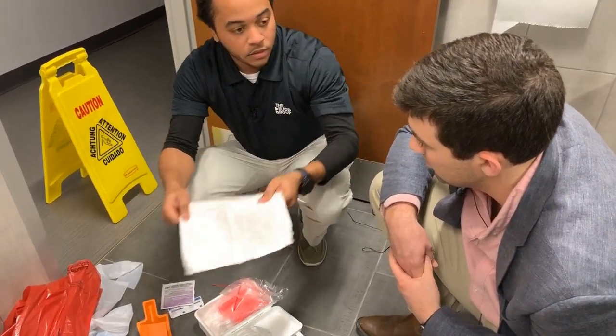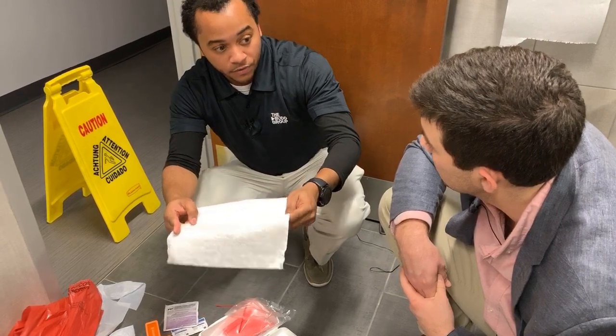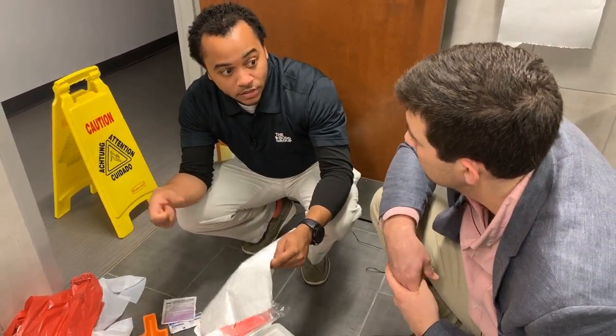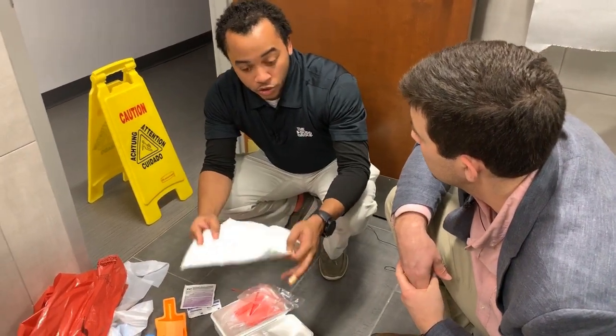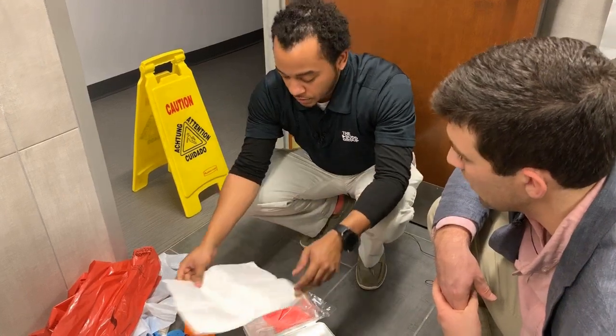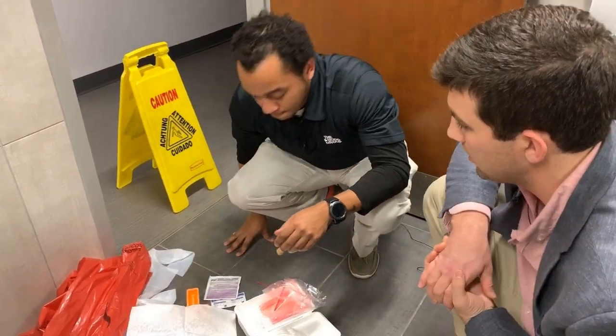This being what you place over the spill itself, getting it up, because what we need to do is we have our disinfectant. Blot this up, make sure it's dry, then you take our disinfectant and we saturate the surface area. All right. Well, I guess let's suit up and get this thing cleaned up.